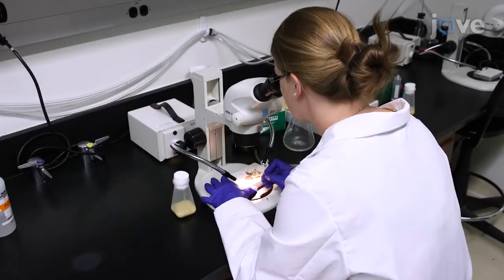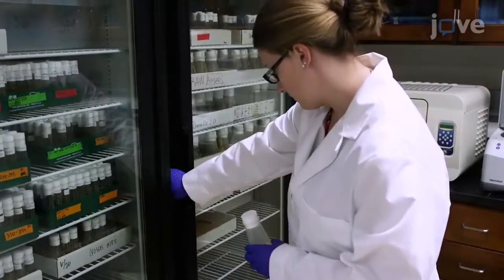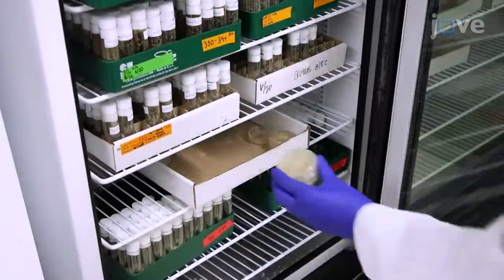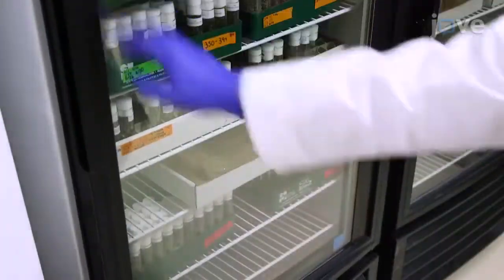For embryo collection, place a minimum of 50 virgin females with 20 to 25 males per bottle with cornmeal agar food and incubate these flies for one to two days before beginning the collections. The day before the collection, warm apple juice agar plates at 25 degrees Celsius overnight.